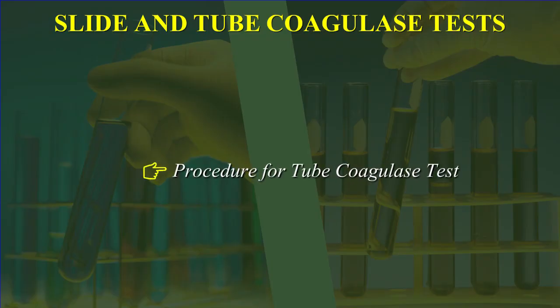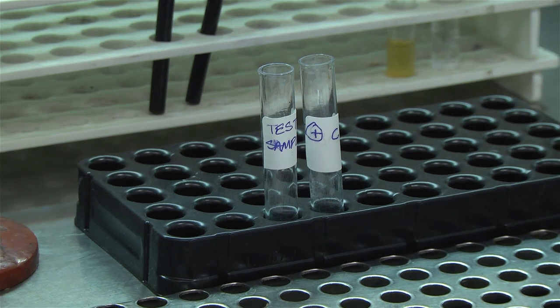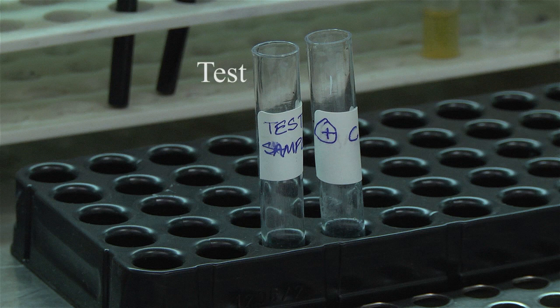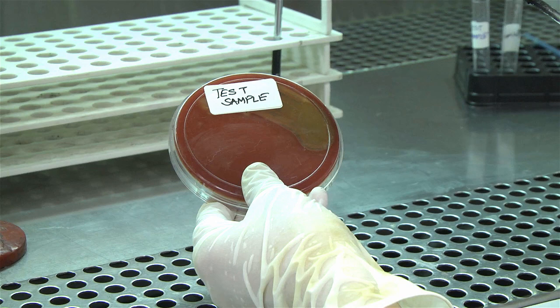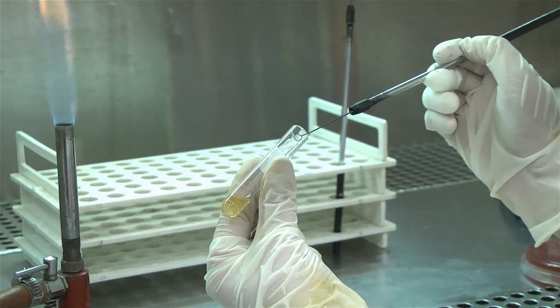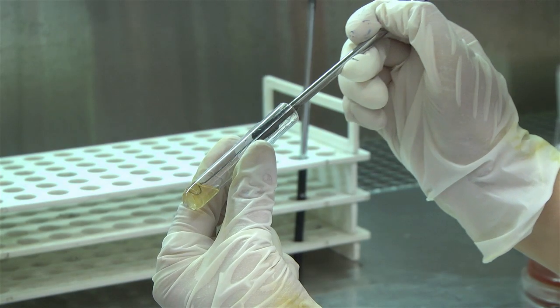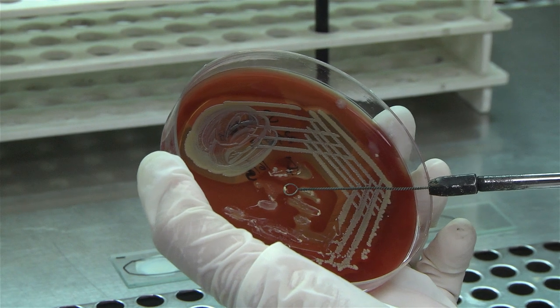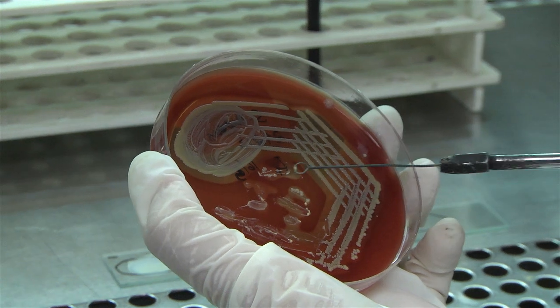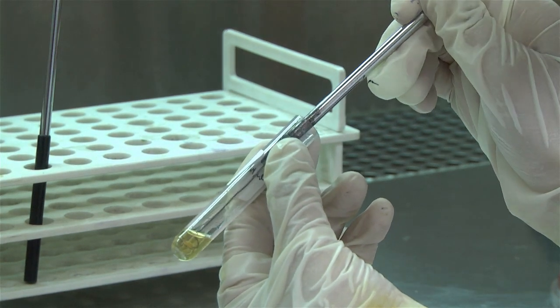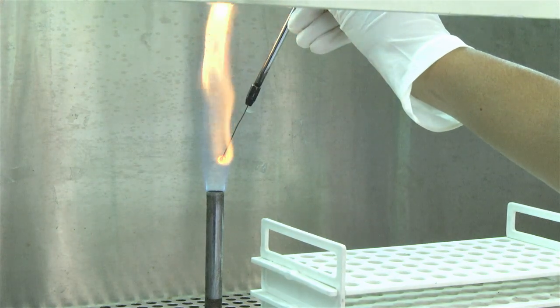Procedure for tube coagulase test: Take 0.5 ml of diluted plasma in two test tubes. Label one tube as the test and the other tube as positive control. With a sterile inoculating loop, pick one to two colonies of the test sample and inoculate in the tube labelled as test. Flame the loop. Similarly, pick one to two colonies of a known strain of Staphylococcus aureus and inoculate in the tube marked as positive control. Flame the loop again before keeping it aside.